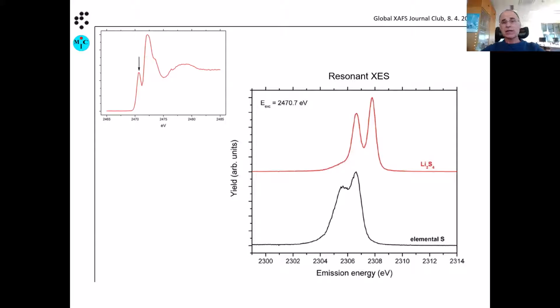You don't want to irradiate it too extensively, because you will ruin the electrochemistry. But we decided, instead of a horizontal scan, to do a vertical scan, that is a simple single emission spectrum. In this case, it's not non-resonant, but resonant. We are interested in the polysulfide.